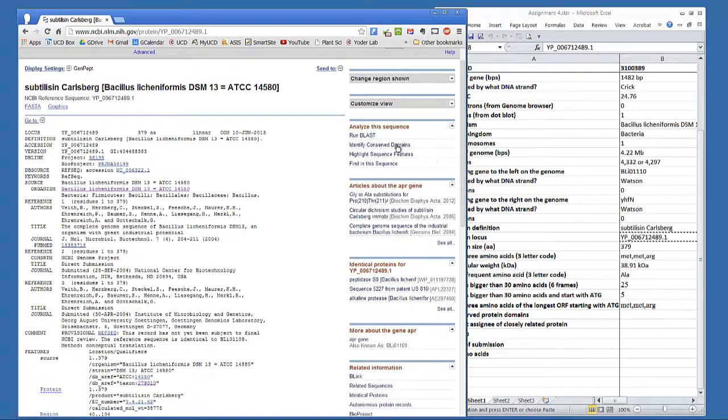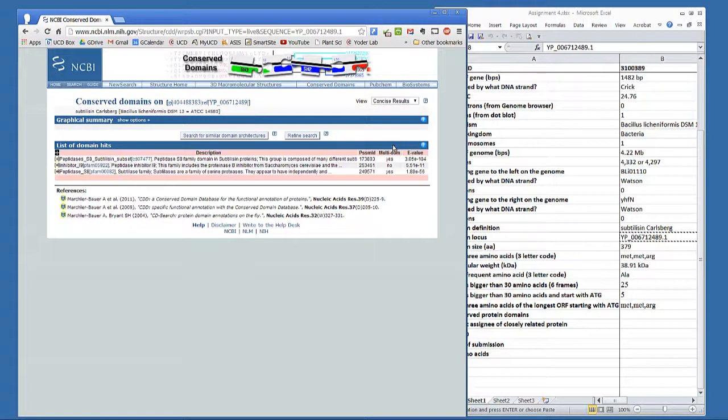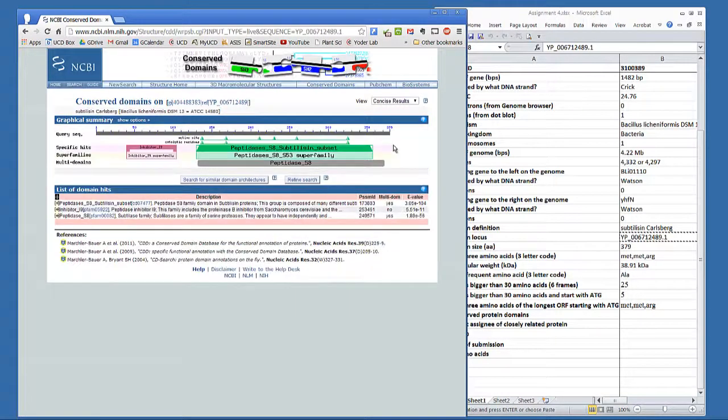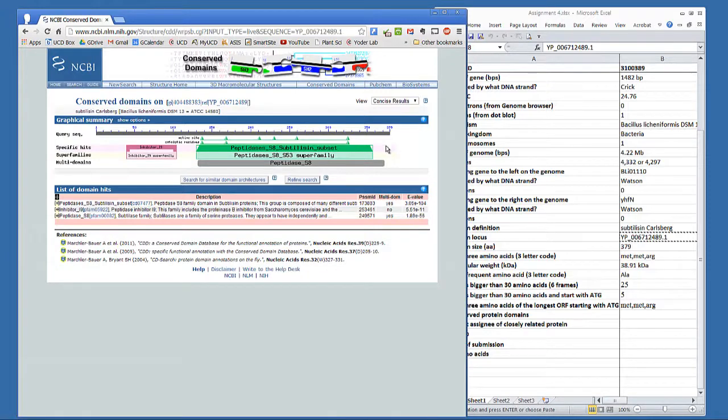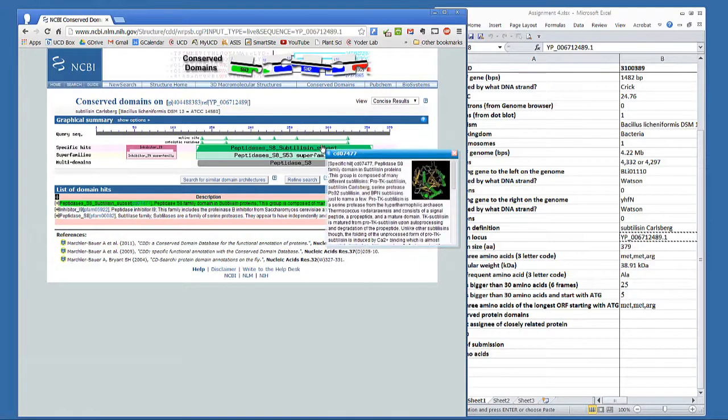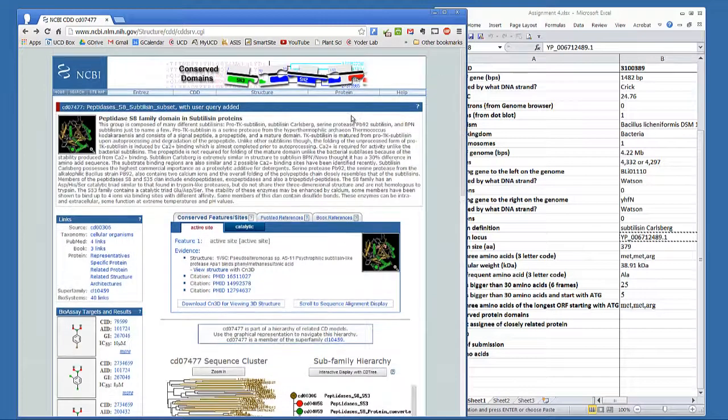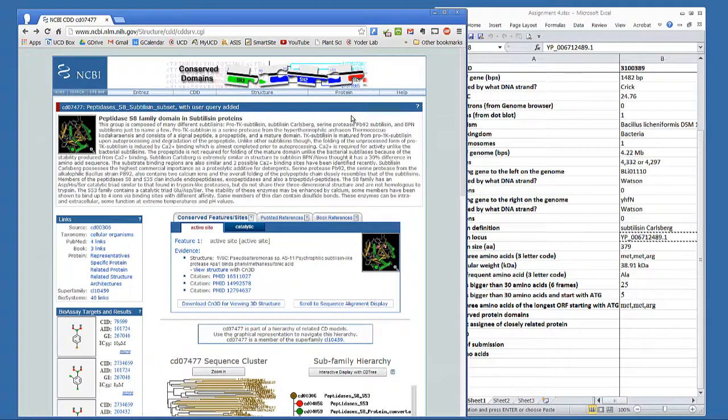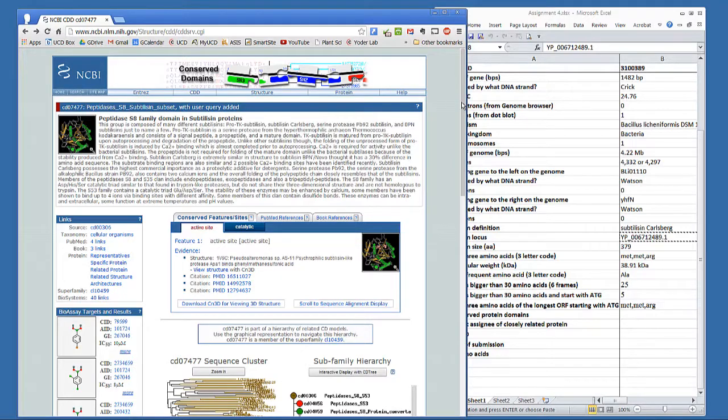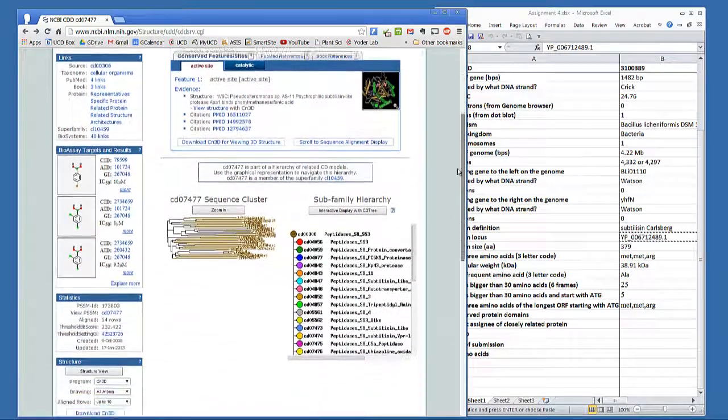Click on the Identify Conserved Domains. This shows protein sequences that are conserved amongst similar enzymes. Click on the domain to learn about its activity. The top line gives the protein domain, and then there's a short description of what that actually does. If you scroll down to the bottom, you'll see different organisms that have that same protein domain.